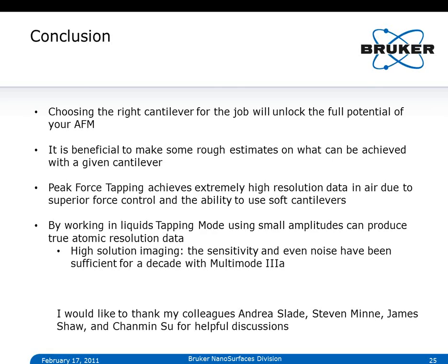And of course, silicon tips are the tips you basically have to use because you need that spring constant to avoid the jump into contact in tapping mode. And of course, do not scan too fast, because if you scan too fast, you run into the issue with the time constant that I showed you. You need a certain amount of time to establish clean feedback so that you can really avoid accidental tip-sample contact.